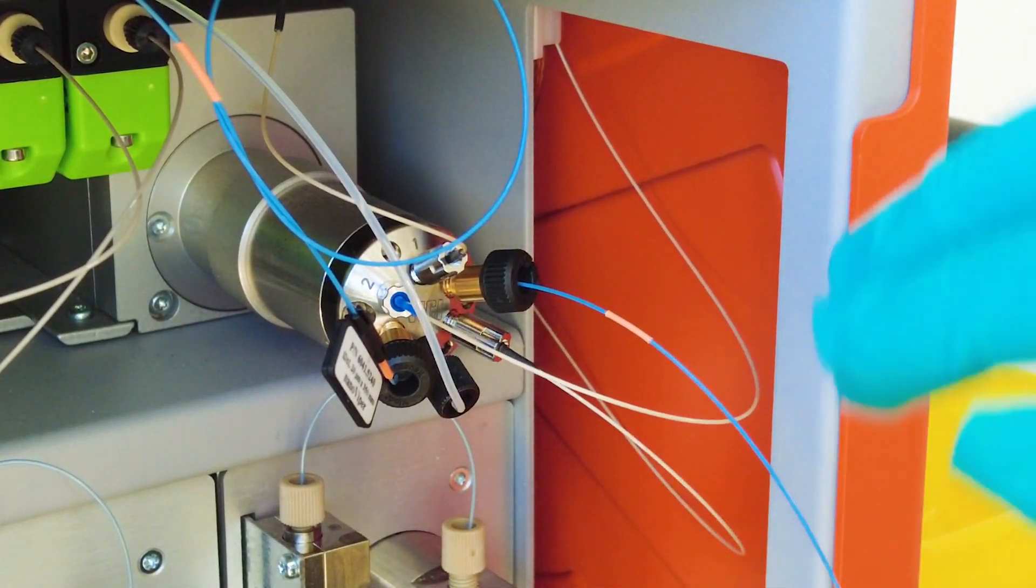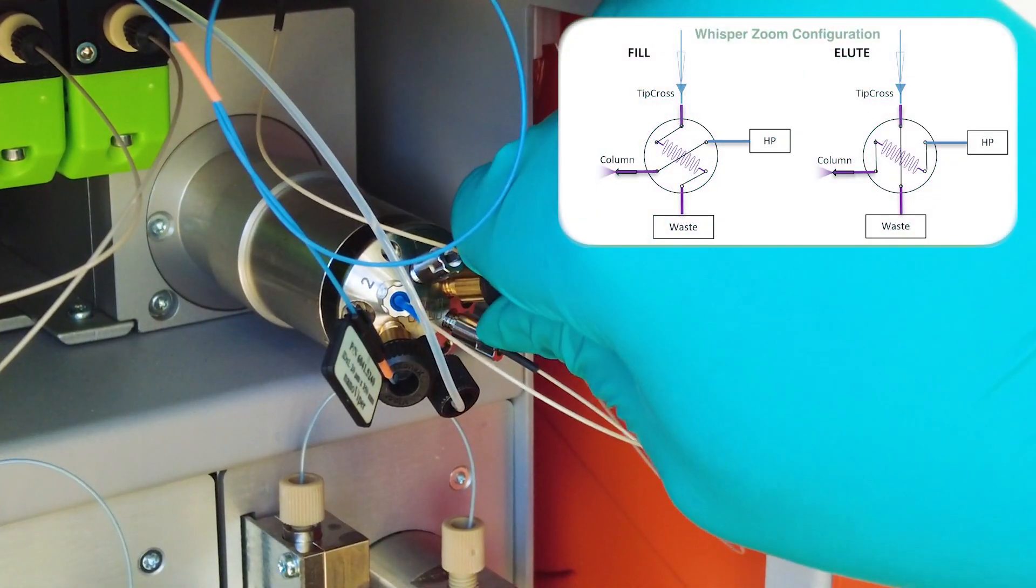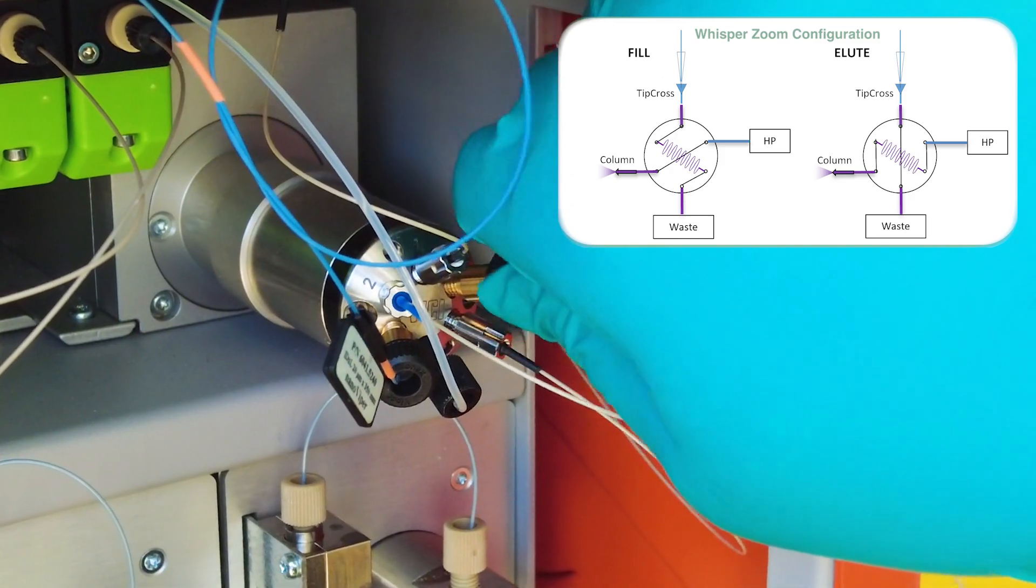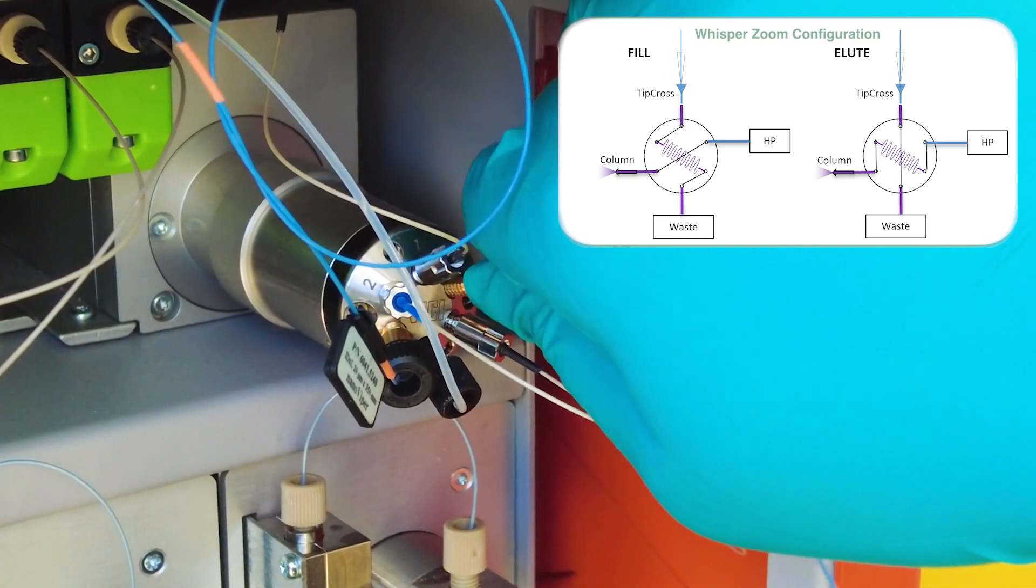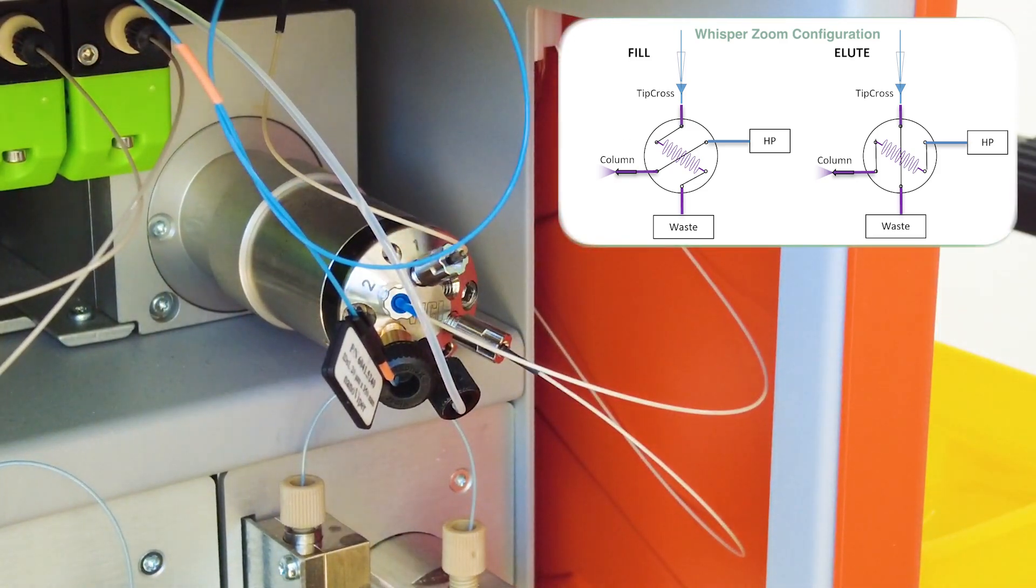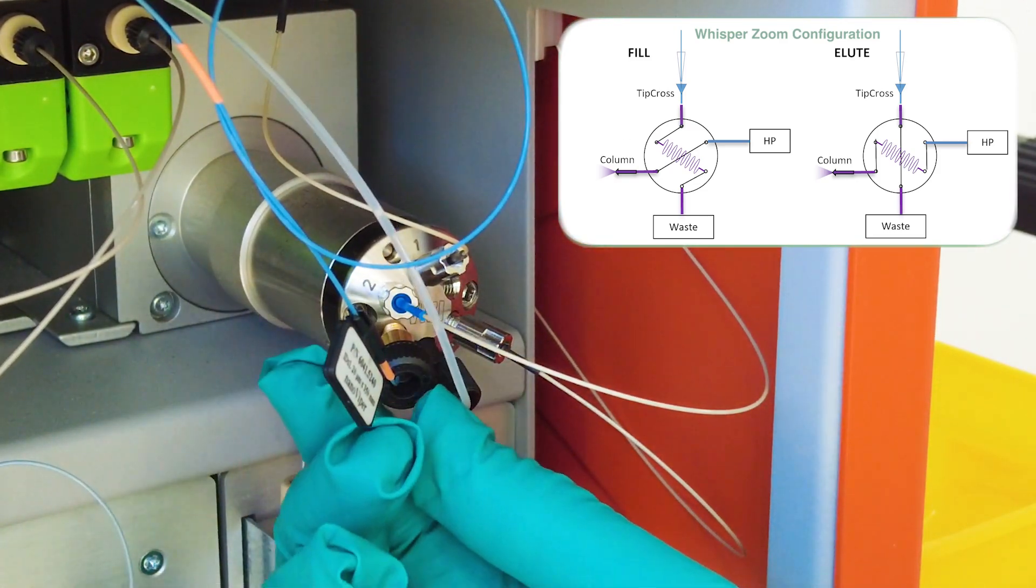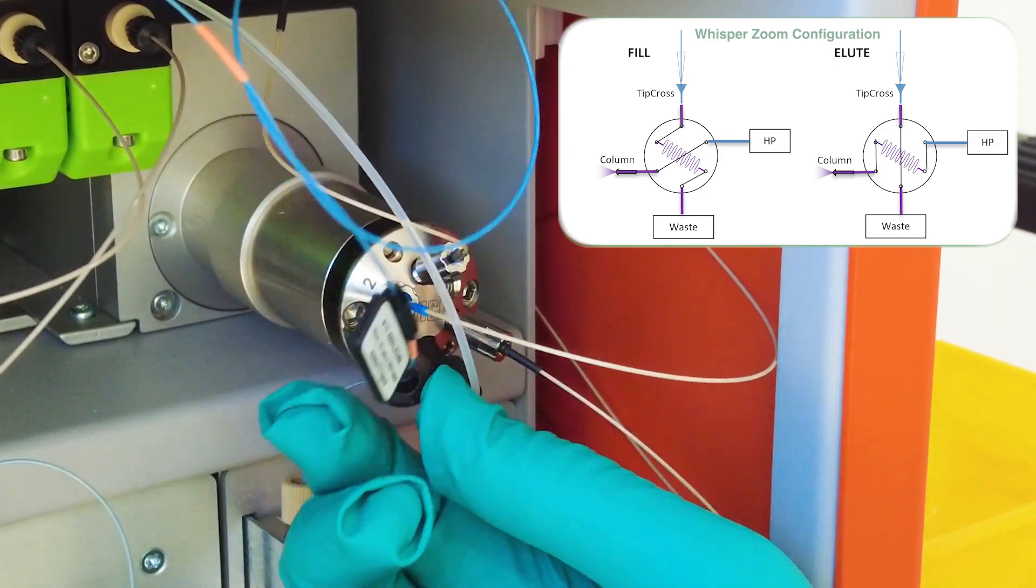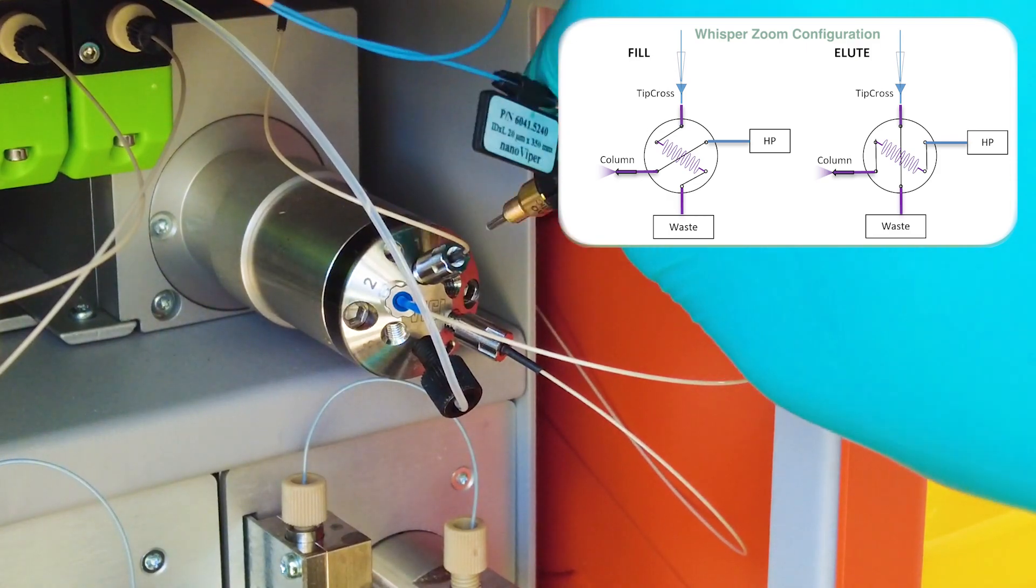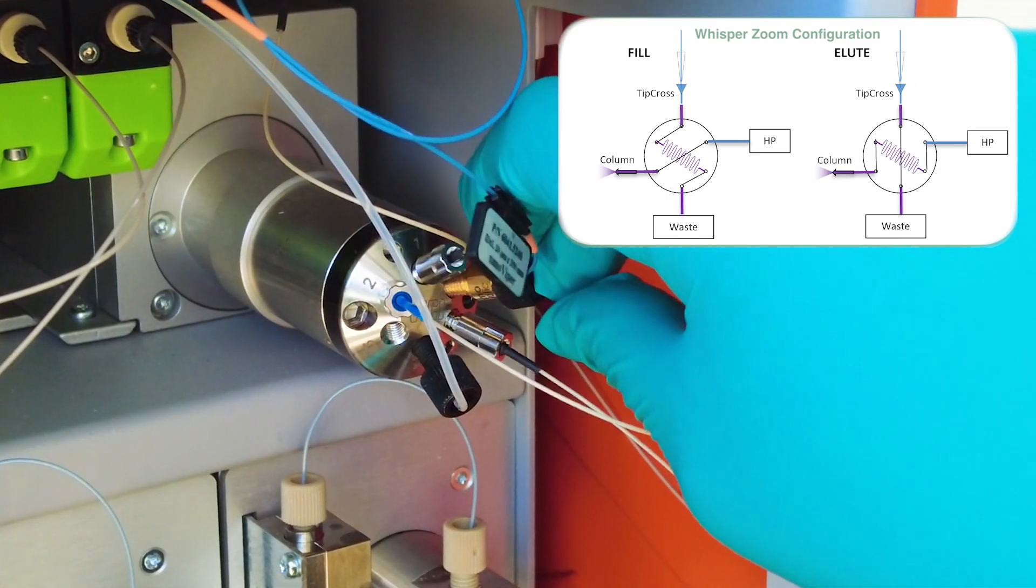The first thing we need to do is switch these two. We disconnect these finger-tight connections, so it should be easy to do. We disconnect the outlet at port six and then we also disconnect at port three. With port three disconnected, we shift that over to position six.